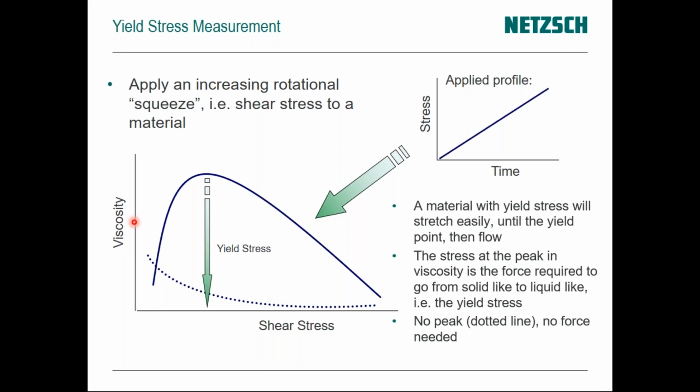Now, if the sample's results come out more or less flat, that would just show it's a viscous liquid. If they're very sharp here, this would show it's more of a brittle gel. So the shape of the curve, or how rounded or sharp it is, indicates whether it's viscous or viscoelastic, or if it just goes up and then straight down again, that would be very elastic.